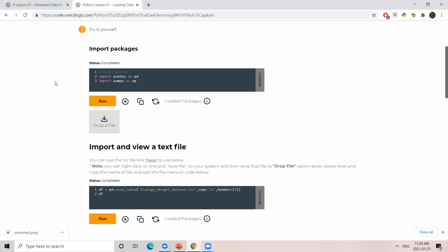So let's say you have a big file with different chromosomes and you want to make that into a nice data frame. There are packages that will help you sort the sequences, and then you will also have the chromosome ID right beside it in its own row. So you might have a column for the sequences and a column for the chromosome number.